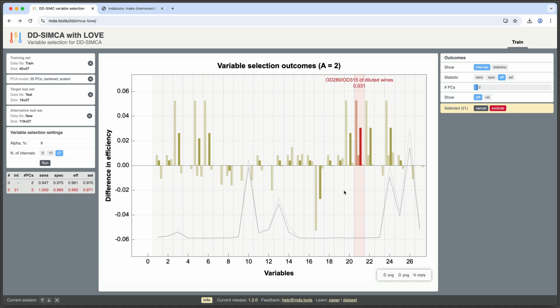So which one to select? Well, I will select, surprisingly, this one. Why? Because it actually doesn't change the sensitivity, and the sensitivity will correspond to the 0.95, which is expected. It is okay to increase sensitivity, but at the very end. At the beginning, it's a good idea to keep the sensitivity close to what is expected.